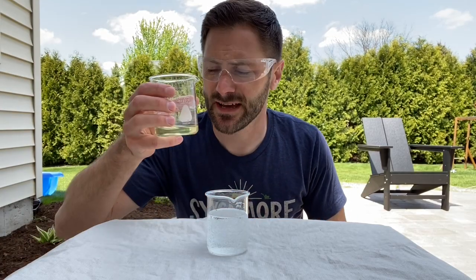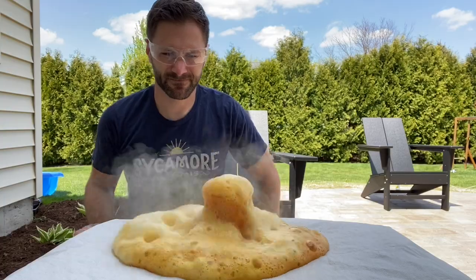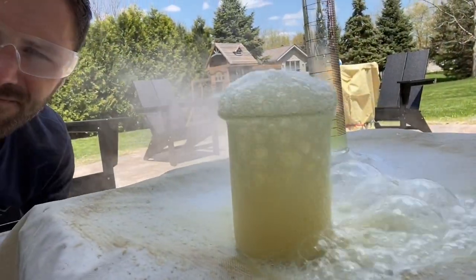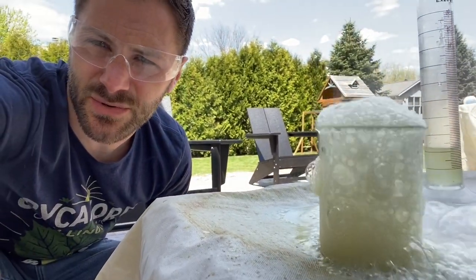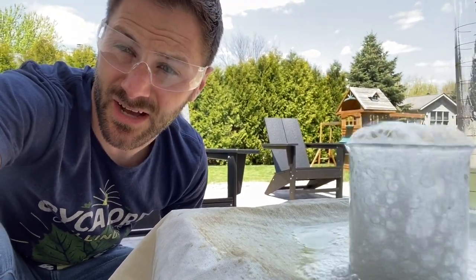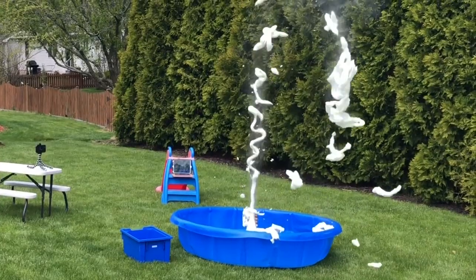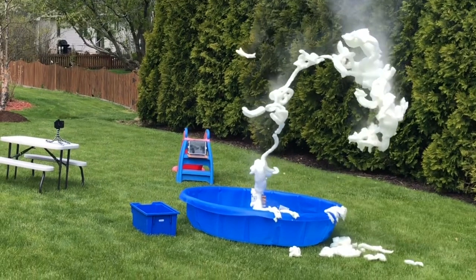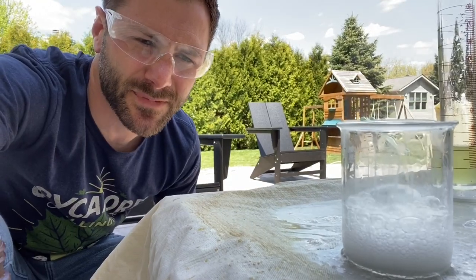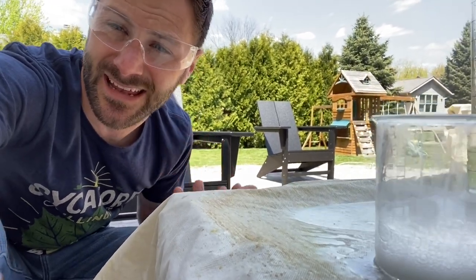It happens slowly over time. But if I add something like a catalyst — like this potassium iodide — watch what happens. All my catalyst is doing is causing that hydrogen peroxide to react a lot more quickly, releasing oxygen a lot more quickly. So all those bubbles actually have oxygen gas in them. Now this looks a little different than the elephant toothpaste display that you saw at the beginning of the video.